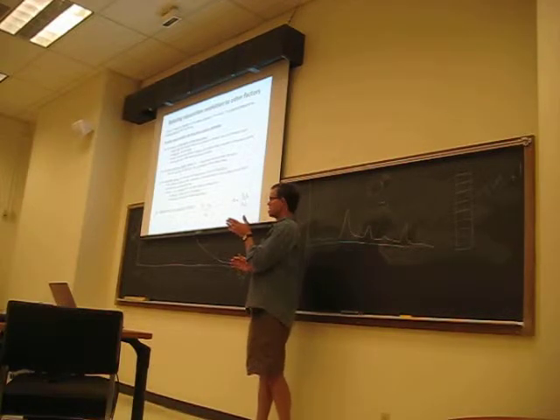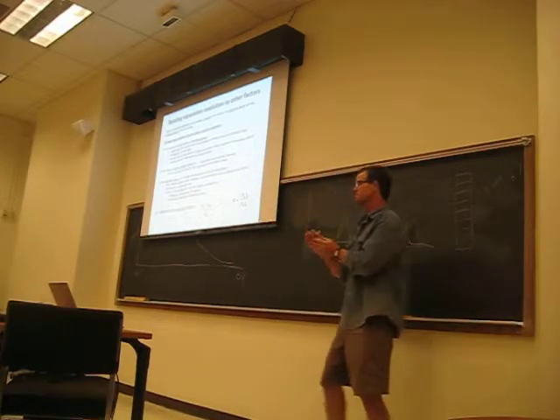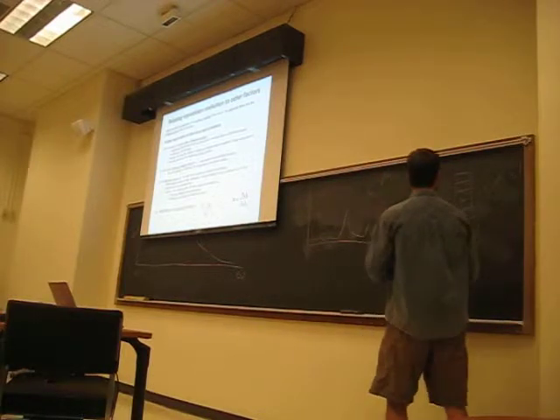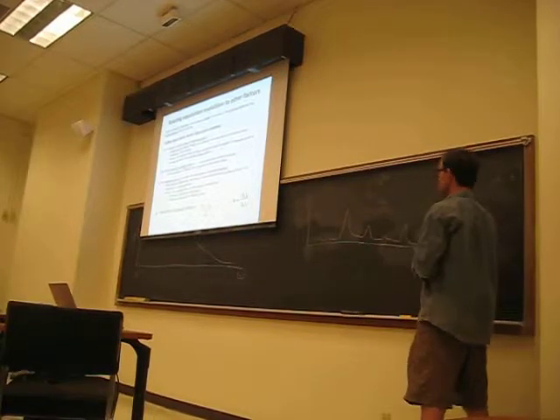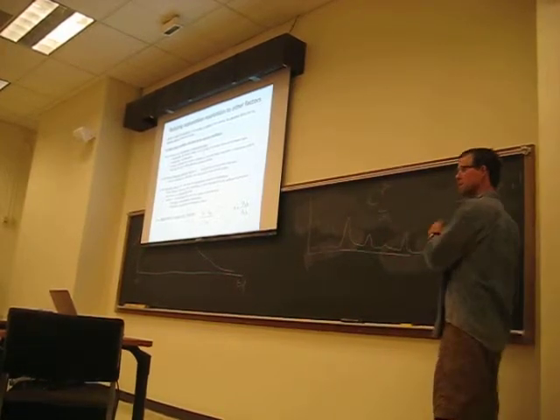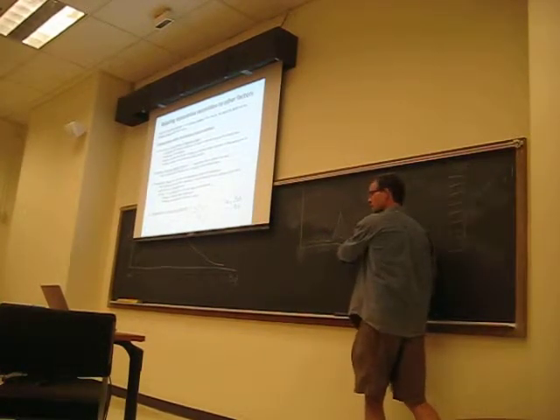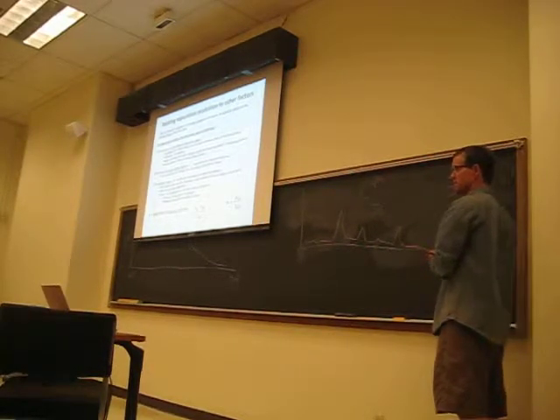So what about that does not make sense? When you connect that with plate height... Right. So this is theoretical, this construct. This is reality. And we use this theoretical construct with plate height to build equations that we can utilize to predict and explain how analytes actually chromatograph or elute across a column, and how we're able to separate them.